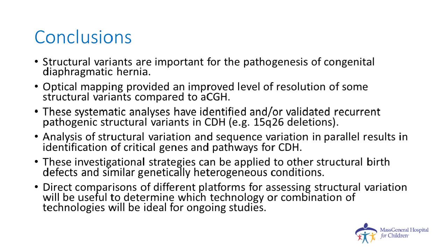In the future, we're really hopeful that direct comparisons of these different platforms for assessing structural variation will be useful to determine which technology or combinations of technologies will be ideal for ongoing studies. As I mentioned, we're in the process of analyzing our whole genome sequencing data from the same cohort. So stay tuned, and I think we're going to be able to see a direct comparison of these different technologies.